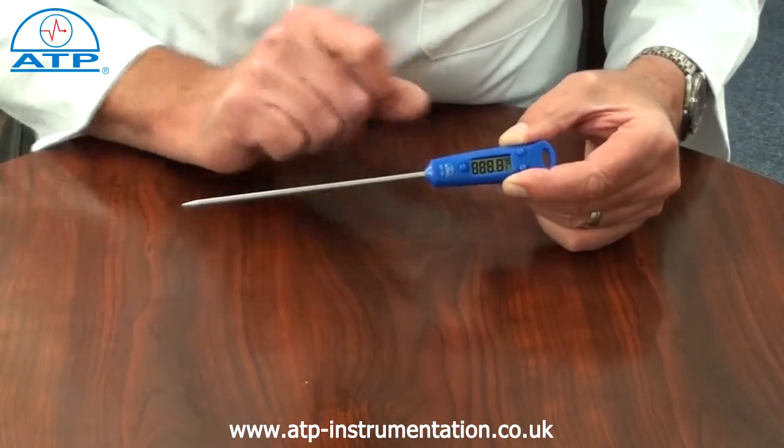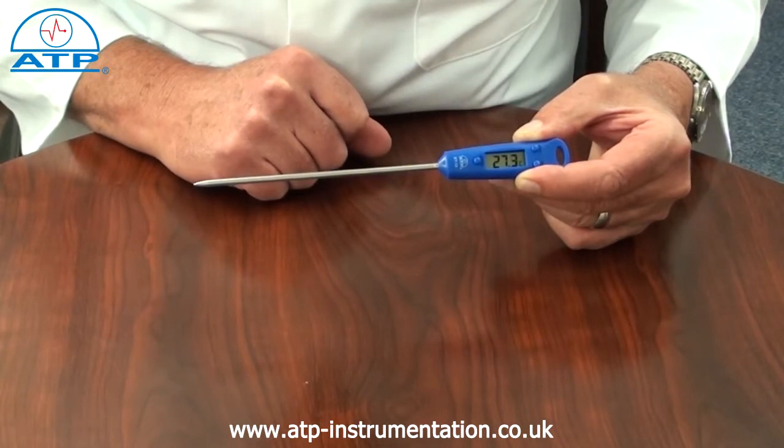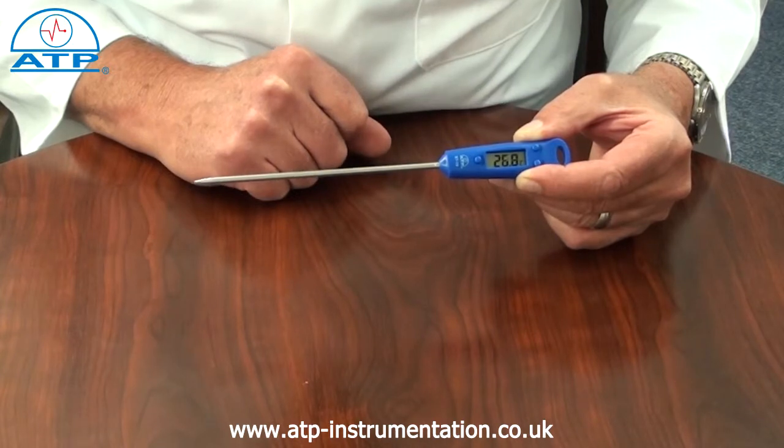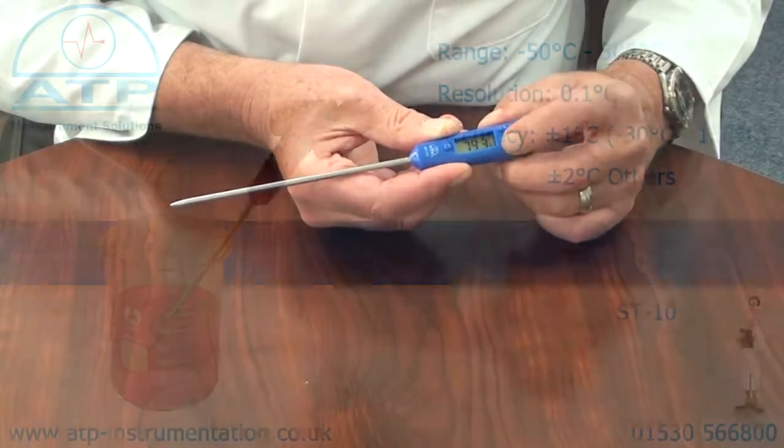It has a measurement range of minus 50 to 300 degrees C, with a resolution of 0.1 and an accuracy of plus or minus 1 degree C. The user can select readings in degrees C or degrees F.